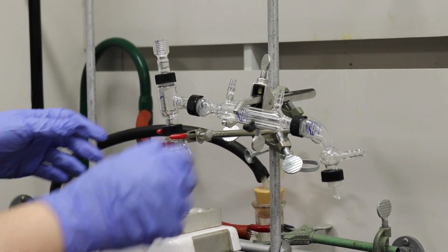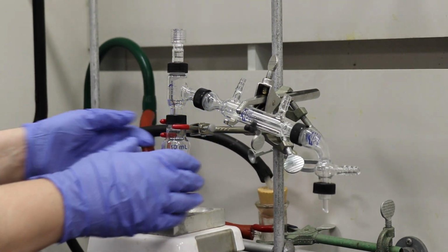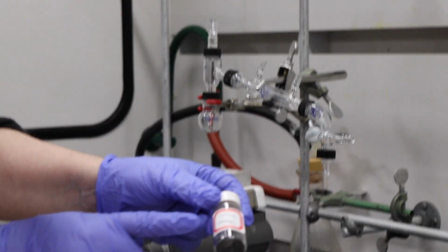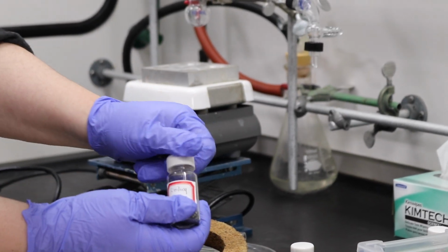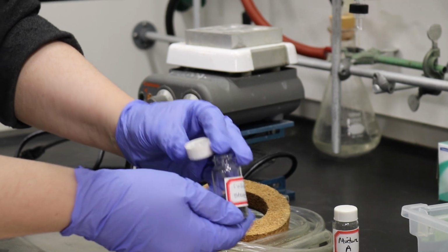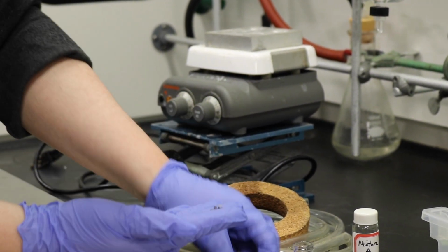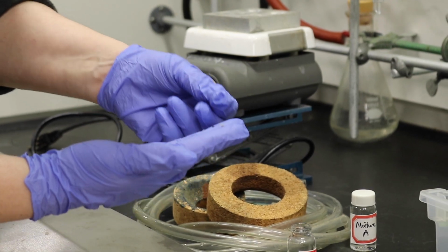We want to make sure that the round bottom flask and thermometer adapter are as straight as possible in the system. We're going to have to put in a boiling stone. We take out a boiling stone here. It's just a piece of charcoal. It will help our mixture boil evenly, so we put it in our round bottom flask.